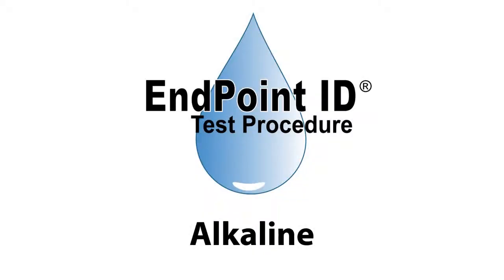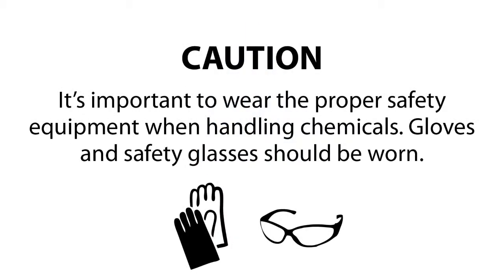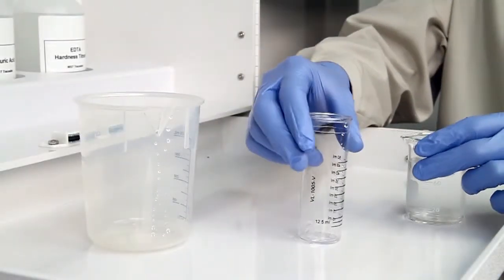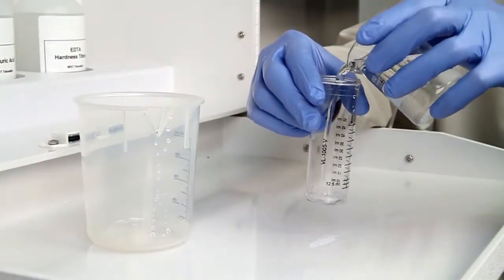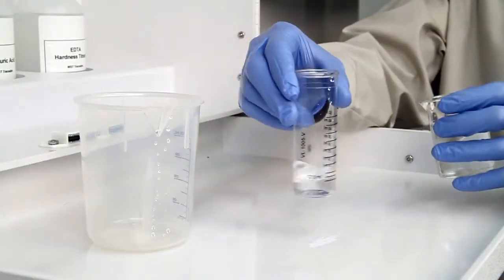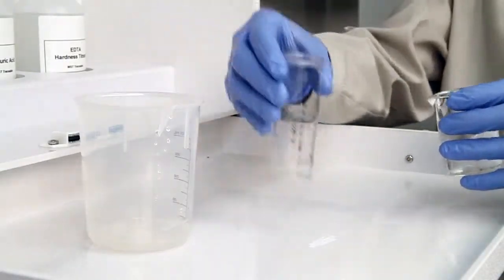This is a demonstration of an alkaline drop count test kit using endpoint ID procedures. The first step according to the endpoint ID procedure is to collect an accurate sample. The smallest change in sample size will lead to inaccurate results.